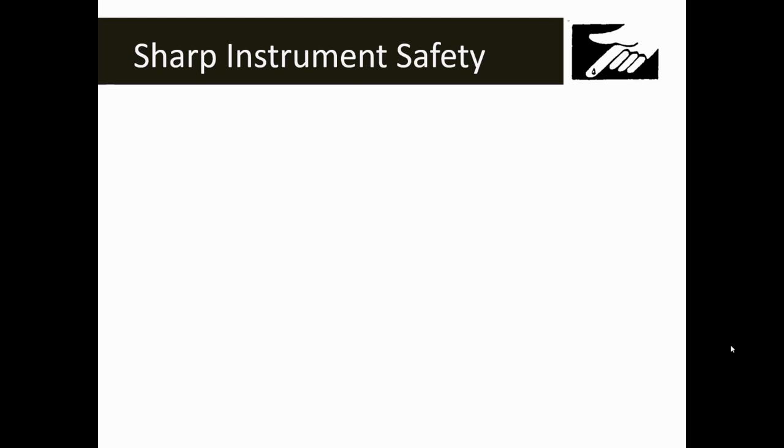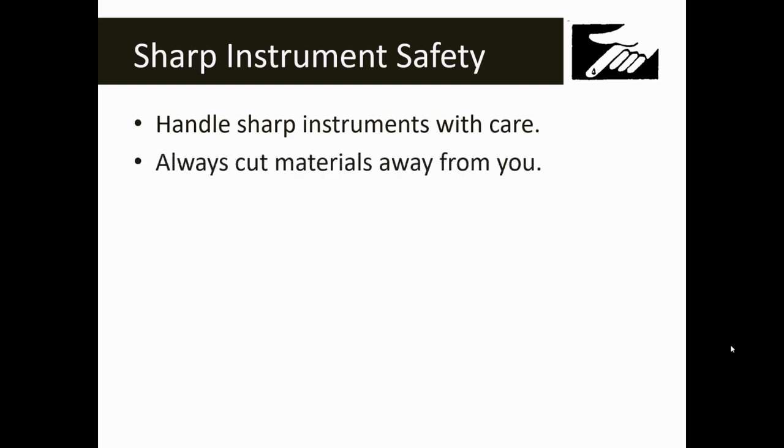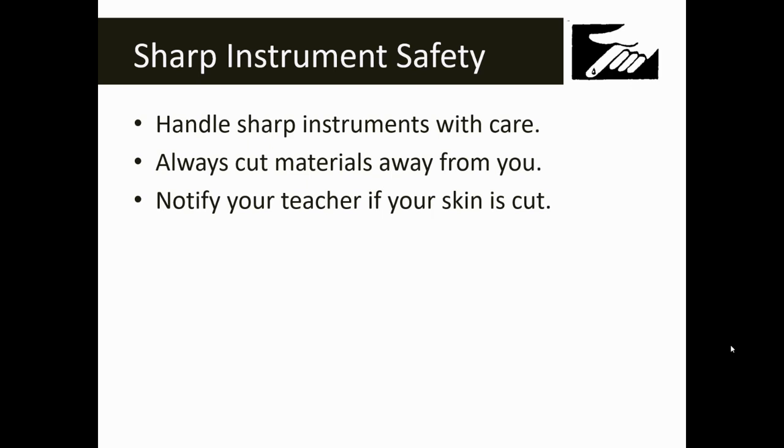There are several symbols that represent the sharp instrument safety symbol — the one shown here comes in many different forms. If you see this symbol, you're going to be working with something sharp and you need to be careful. Handle sharp instruments with care. If you have to cut any material, always cut carefully and away from you if possible. Accidents do happen — if you get cut in the lab, make sure that you tell somebody.